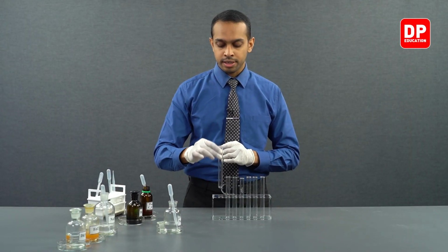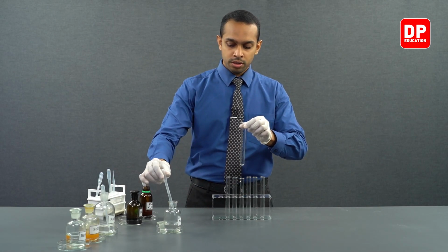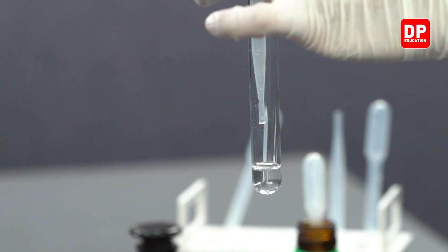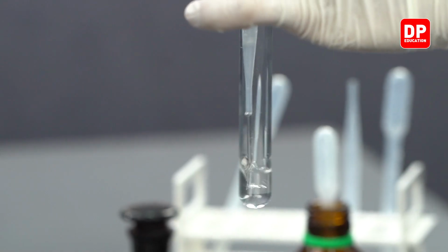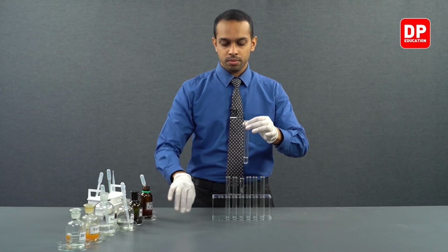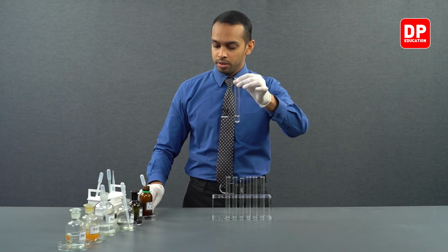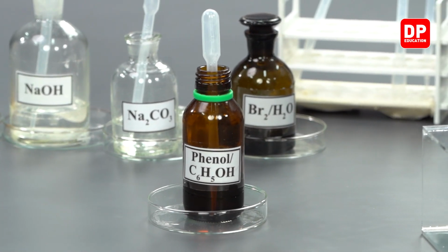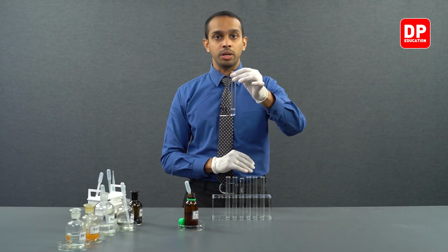Let's take a test tube and add a small amount of sodium carbonate into our test tube. We have our sodium carbonate solution here. Let's take our phenol and add a small amount of phenol into this sodium carbonate.